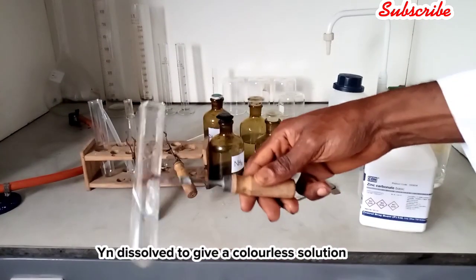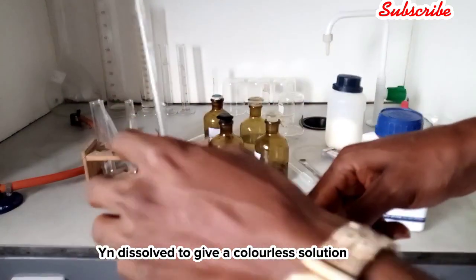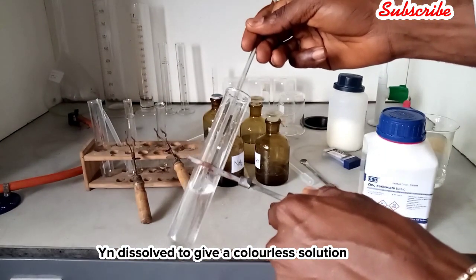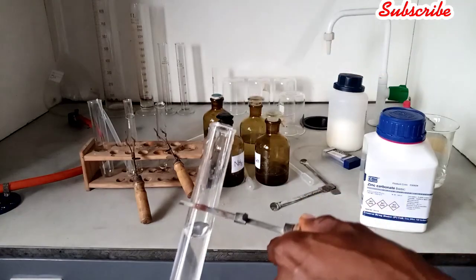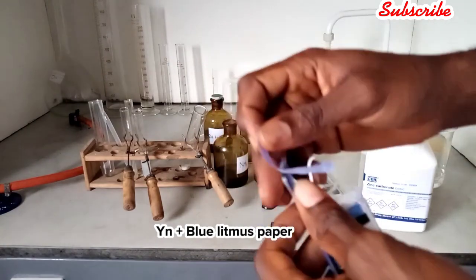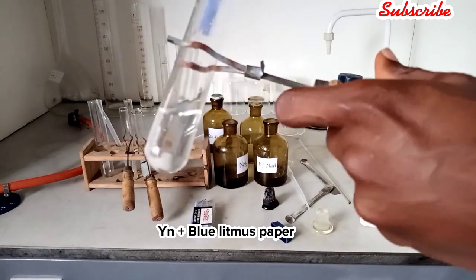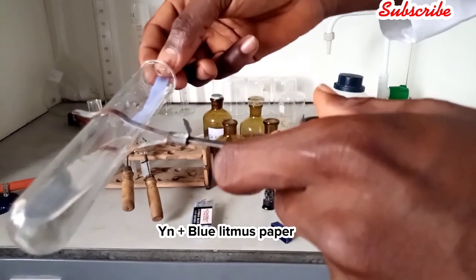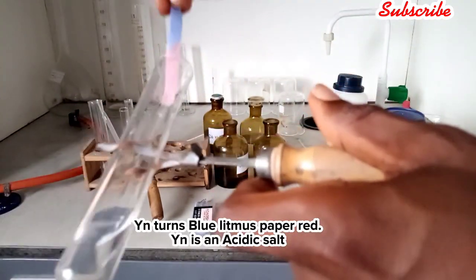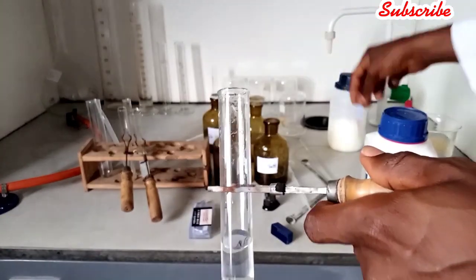We found out that Yn dissolves in distilled water, so Yn is a soluble salt. And then we'll go further to test with blue litmus paper. You observe that it turns blue litmus paper red. There from the inference, Yn is an acidic salt.